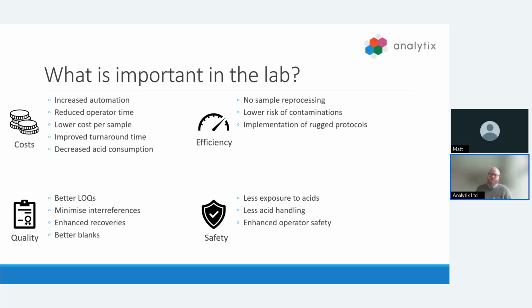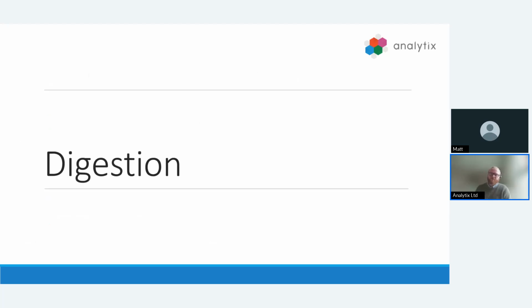And all of this can be achieved by choosing an optimized sample preparation approach, and we'll focus on how these 3 different approaches can support benefiting all these areas.